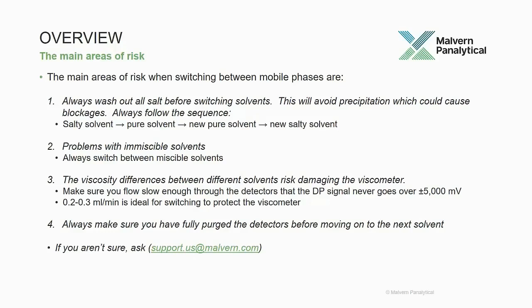So always follow the sequence of moving from a salty solvent to a pure solvent, to that pure solvent, then switch to your new pure solvent, then add salt, and then you're ready to run. This will prevent the risk of any salt precipitation and any blockages.